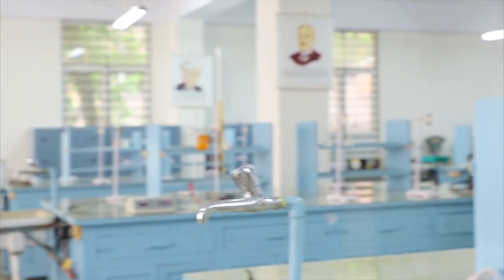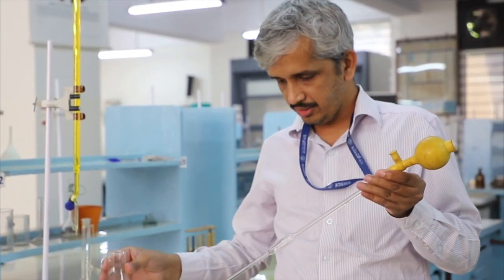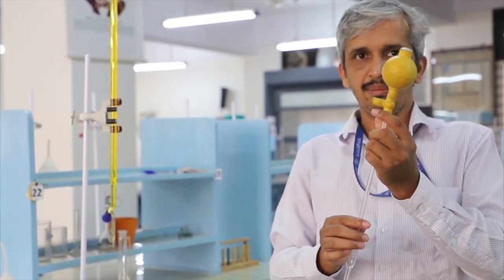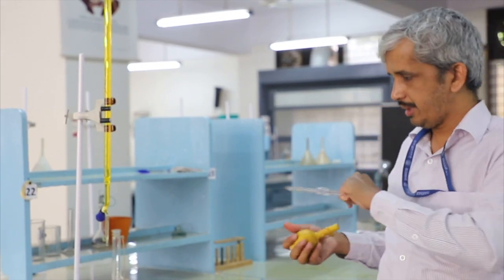In a similar fashion, one can pipette out any solution. The solution may be given in any flask. So you can use this pipette and a pipette filler, and you can pipette out using this pipette filler. Okay, so this is about the 10 ml pipette.